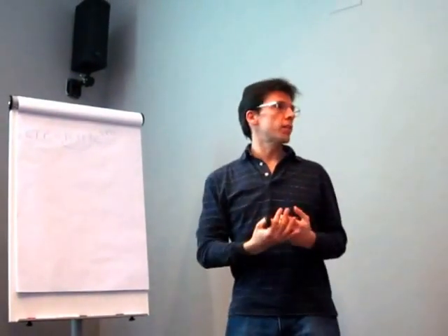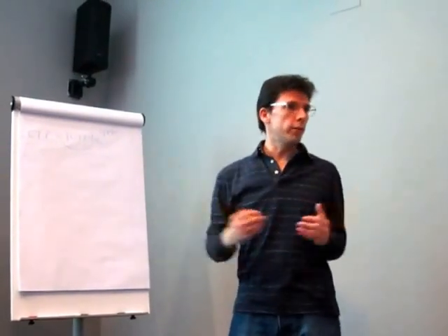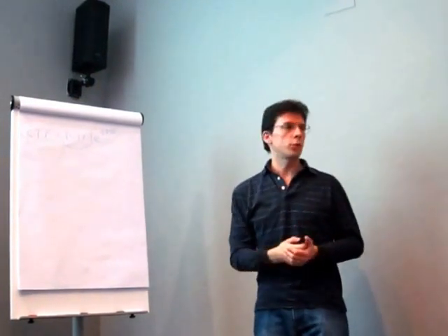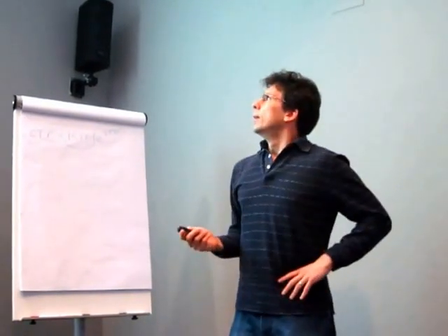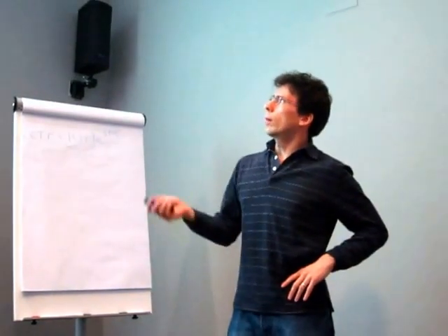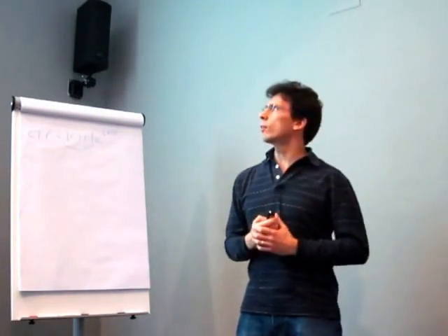There are convergence theorems in the infinite long run. So if you run it forever, you are sure that you can reach the global minimum. Normally you never run it forever, so in practice you get trapped in local minima too. And so we have seen different possibilities to get the initial volume.